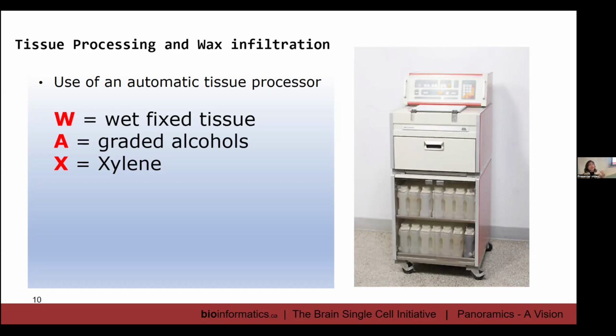And the fixative is actually what's going to protect it while it's going through all these series of solvents. And it'll actually go through heat as well. There's a little bit of heat, 37 degrees in this machine. On top of it, you've got pressure and you've got agitation and you've actually got a vacuum to actually put the tissues in that machine, and the tissue will be infiltrated with the liquids on all sides. And it'll be kind of forced into the tissue.